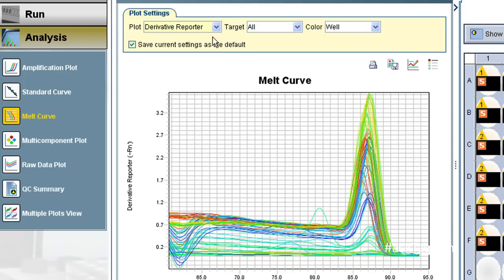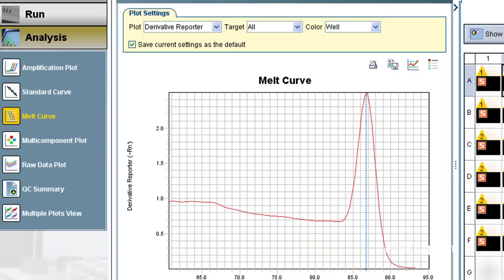If you choose the derivative view from this drop-down menu, the drop-off gets converted into a peak. What we're hoping to see is one clearly defined peak, which suggests — doesn't prove, mind you, but suggests — that you have a clean amplification of a single product.